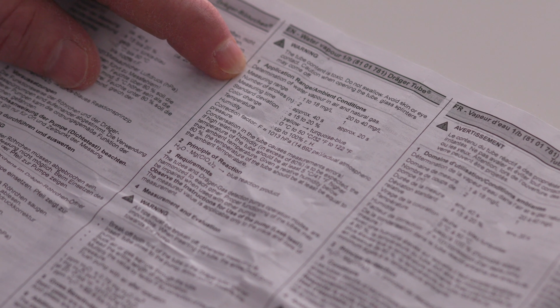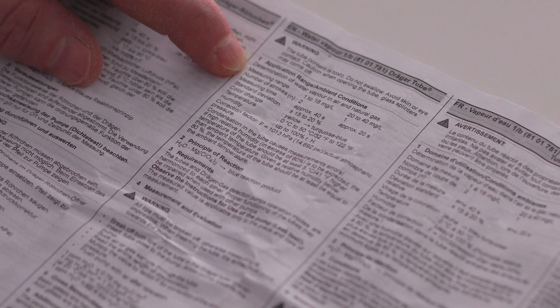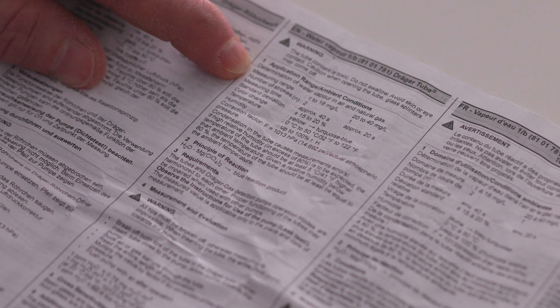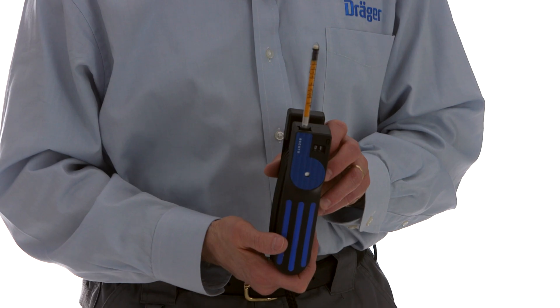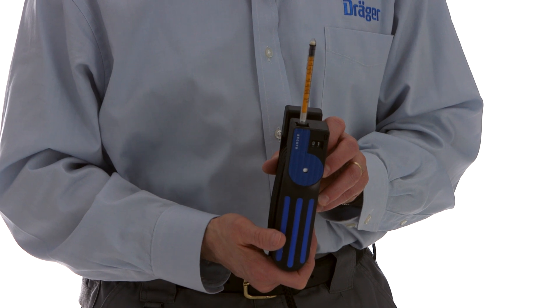Take the required number of strokes according to the instruction sheet in the package. This tube has a high range scale based on n equal one stroke and a low range based on n equal two strokes. This means that if the discoloration reaches the high range with one stroke, read the tube. But if not, take one additional stroke and read the low range scale.